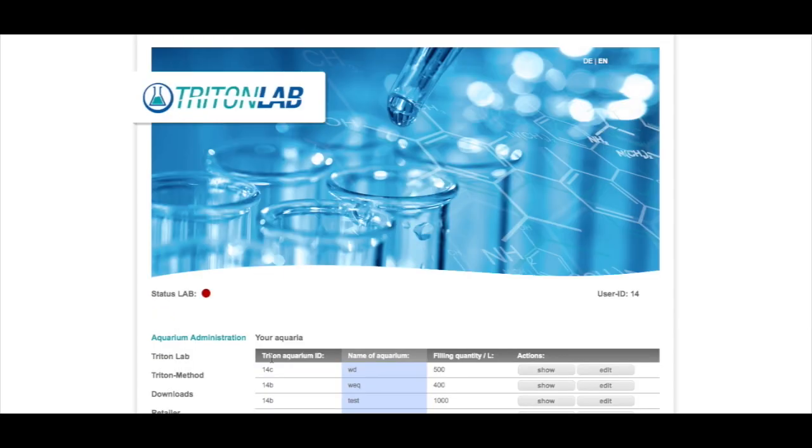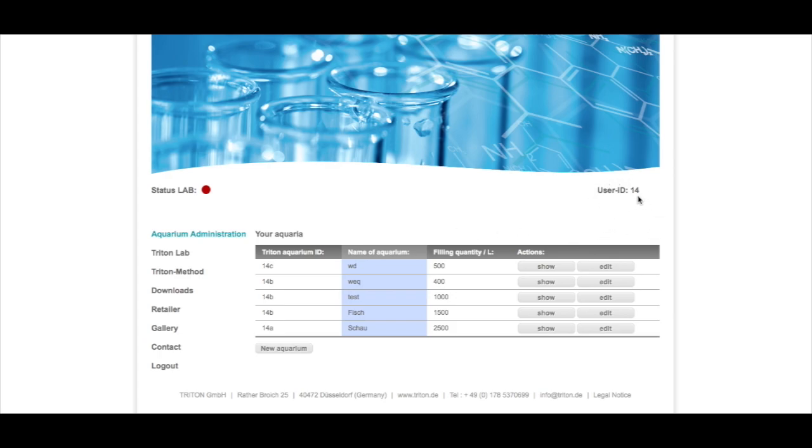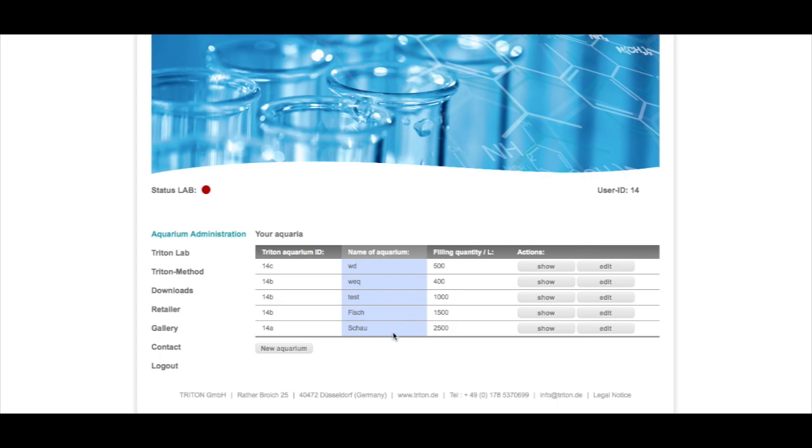Okay, so when you're logged in you can see this area and here this is your account administration area. On the right hand side you have your user ID which is very important. I will explain it in a few seconds. In this area you have all your aquariums. Normally hobbies having like one or two aquariums but public aquariums or retailers often have more so we give you the opportunity to put in every tank you have under one ID. This makes things really easy for you.